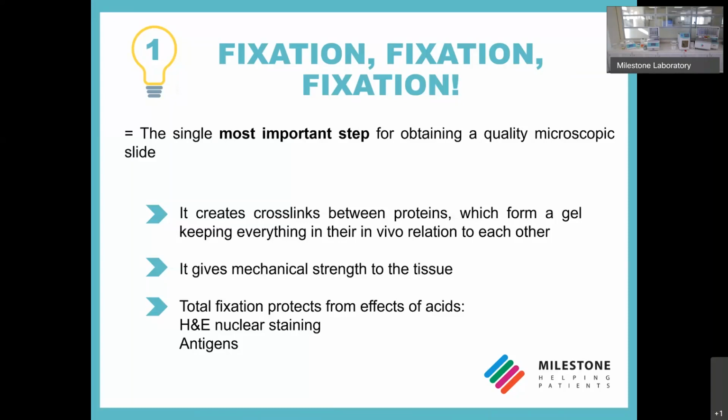In order to protect the cellular and fibrous elements of bones from decalcification reagents, it's particularly important to properly fix, and I repeat, properly, the samples before decalcification. Poorly fixed specimens become macerated and stain poorly. From here, the importance for big bones to use a good quality saw and slice them into thin sections.